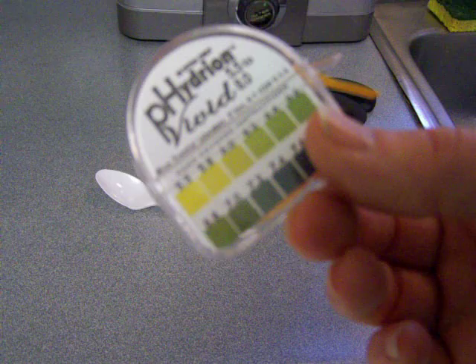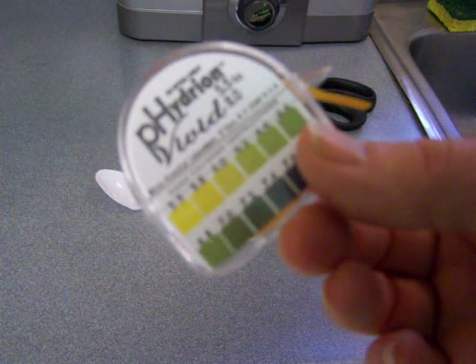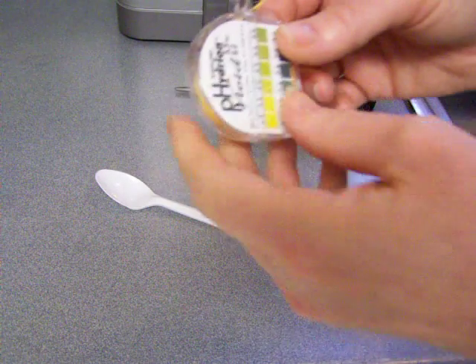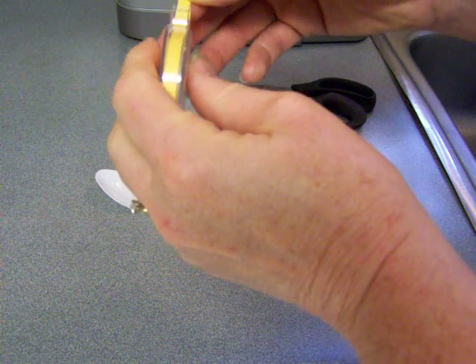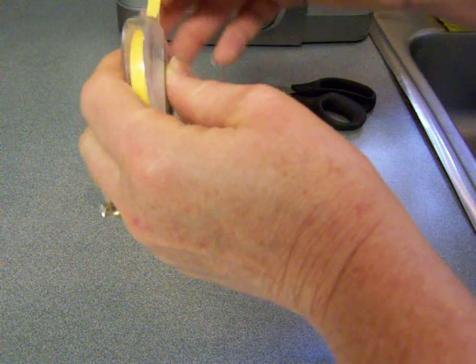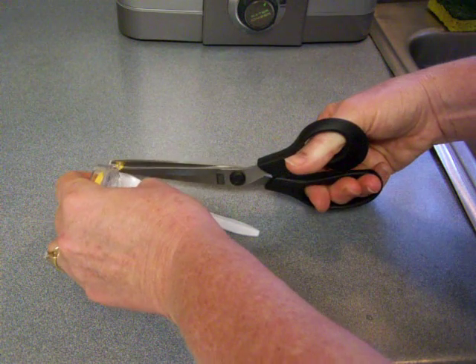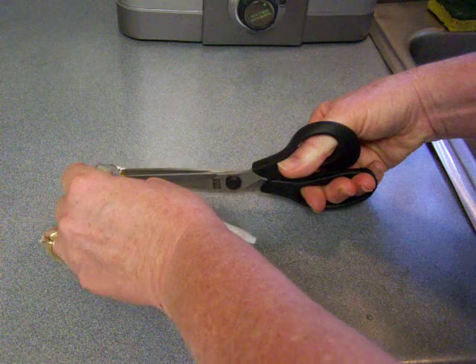The directions actually say to use about an inch of the paper for each test, and I usually just cut it and use like a quarter inch. Now this has a little cutting edge here, but for the purposes of this I'm just going to cut it with the scissors.